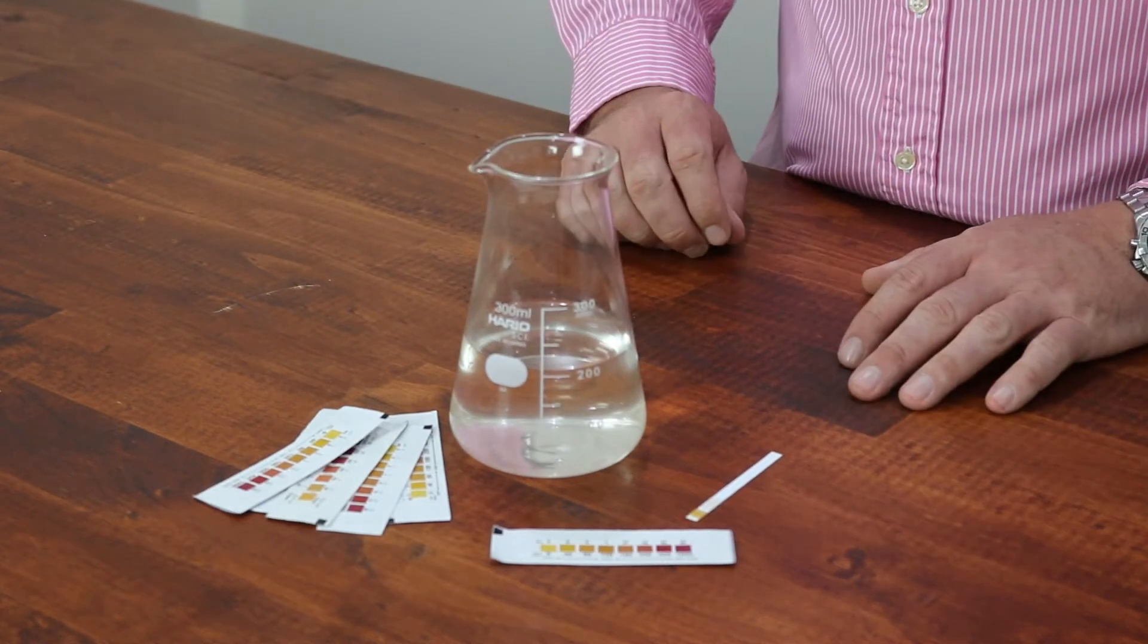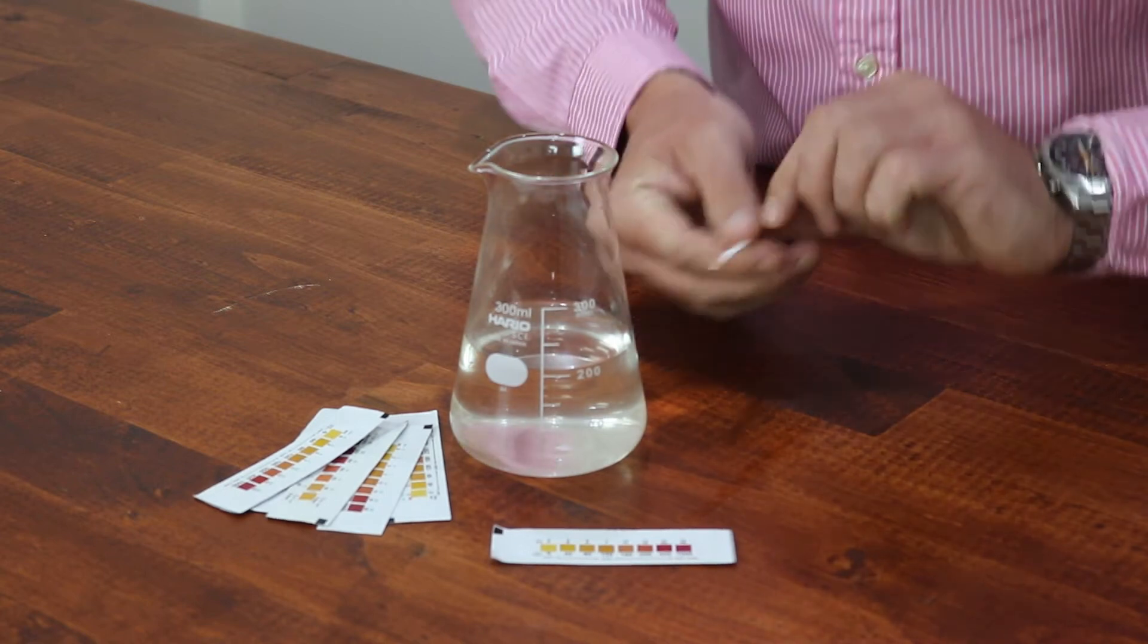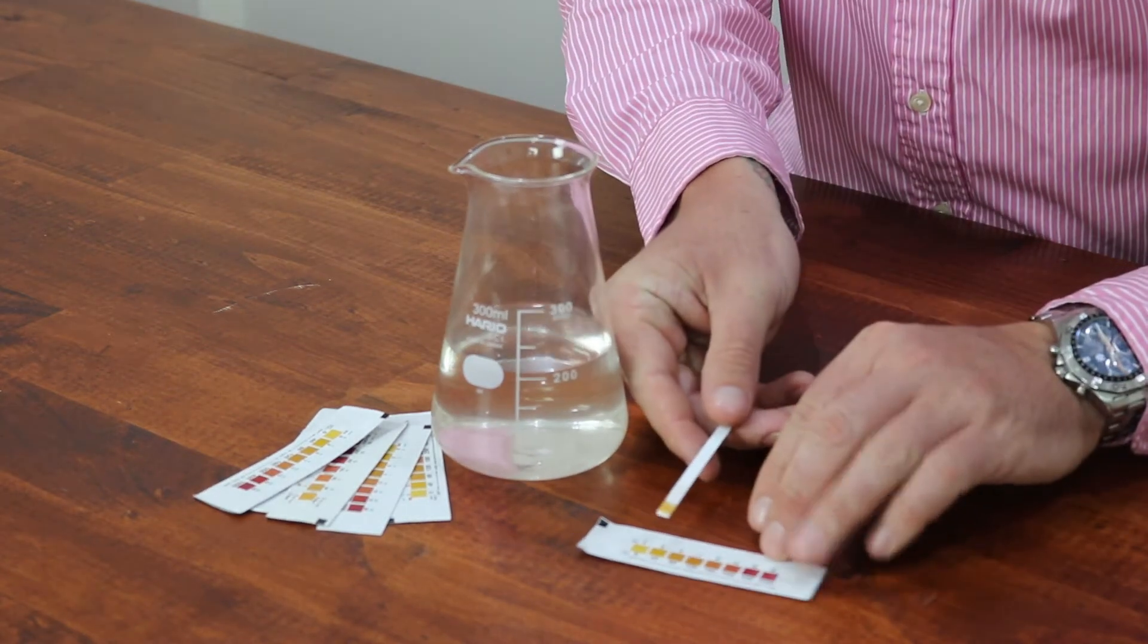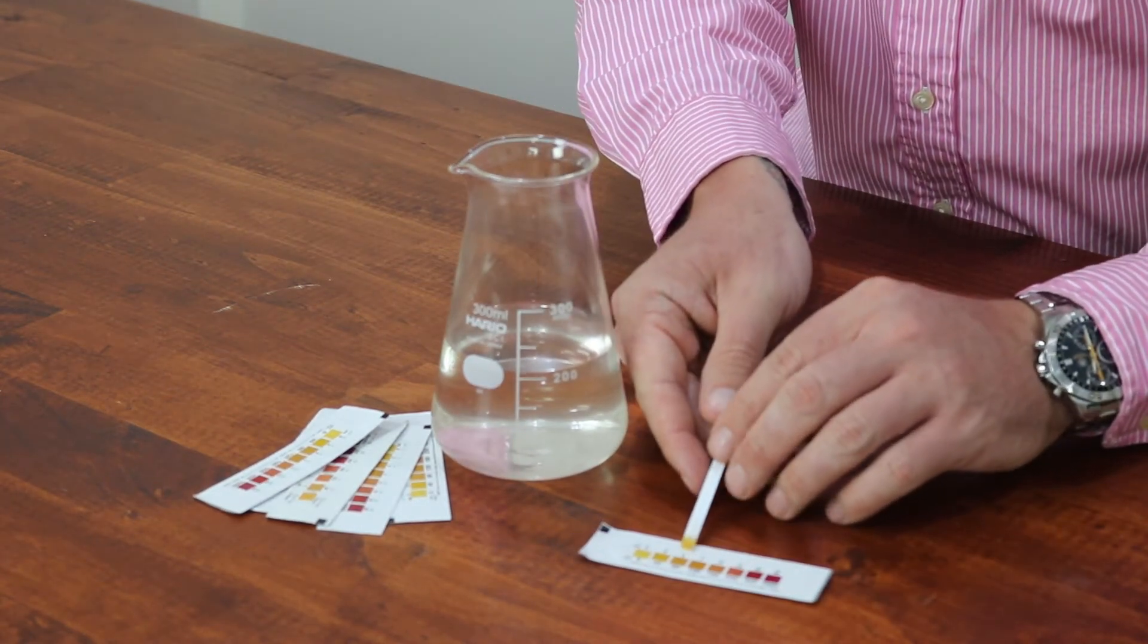Now that we've allowed the strip to rest for 20 seconds, we take the strip and put it against the color indicator chart and we put it up close to the closest color matching block that you have there.